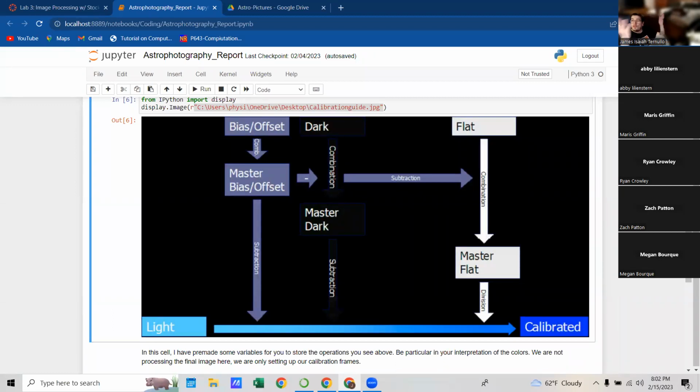And when we take out all the external light and we reduce our exposure time to the shortest we possibly can, we collect all of the electrons from that test, as well as a little bit of thermal electrons that we'll talk about here in a minute. So does that make sense? Is that clear? Does anybody have any questions about that?